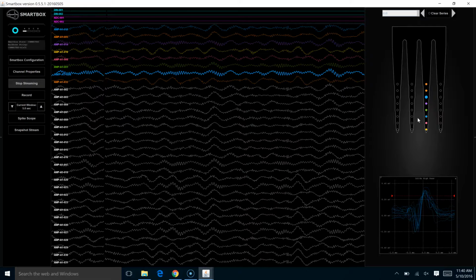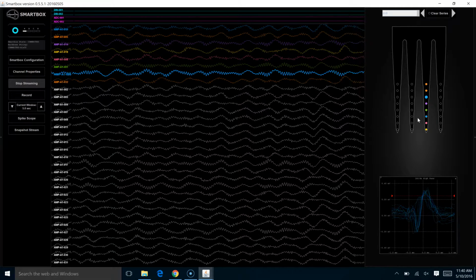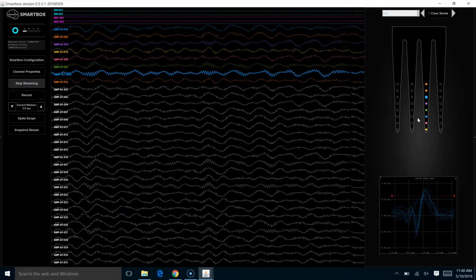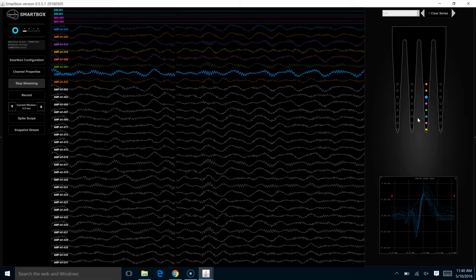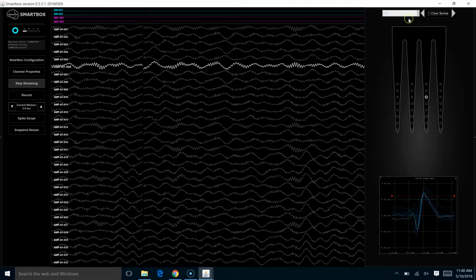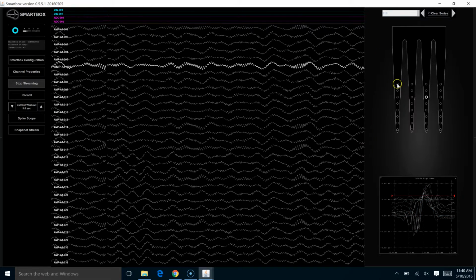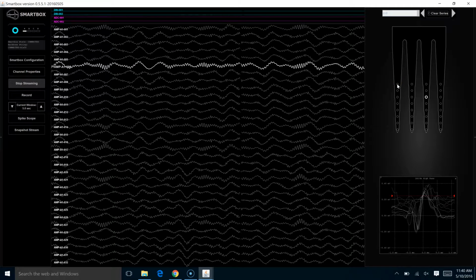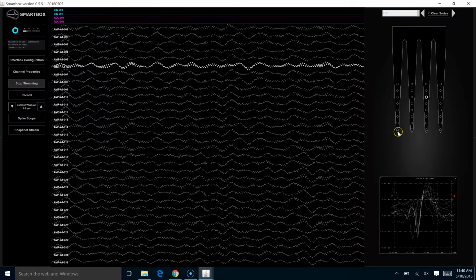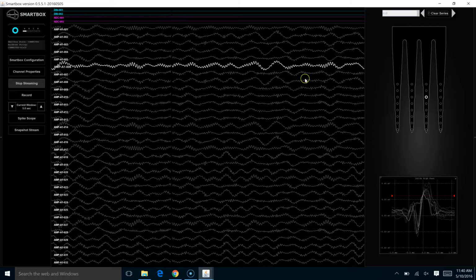However, there is more than one way to use this probe-centric approach. In a recent experiment that I participated in, instead of choosing individual channels of interest, let's come up here and clear our series. In this particular experiment, it was decided that we really wanted to know before we even started looking at the data exactly how the sites corresponded to each other.